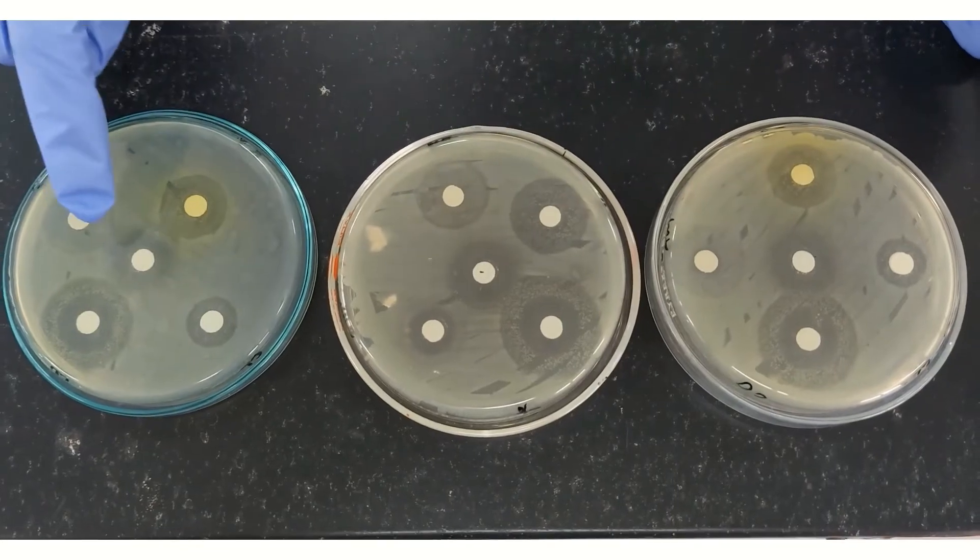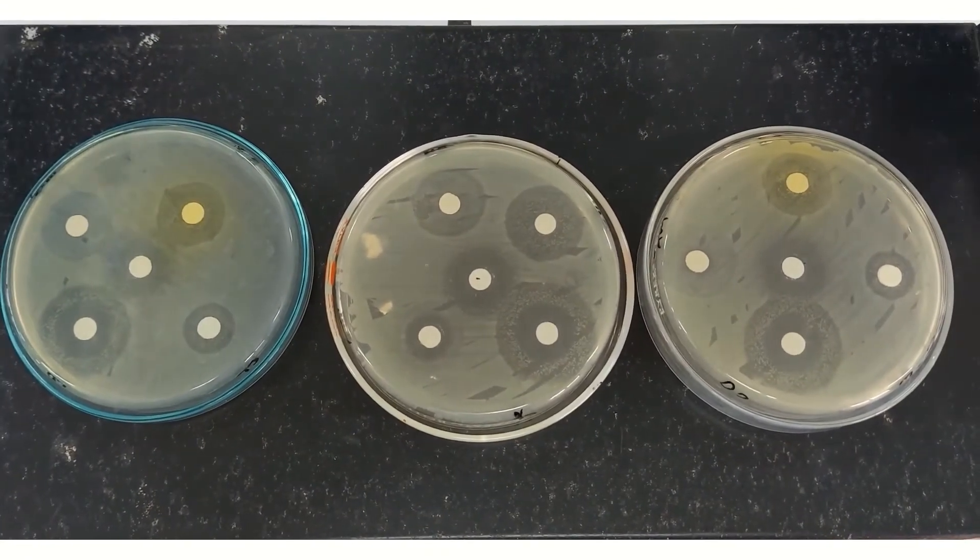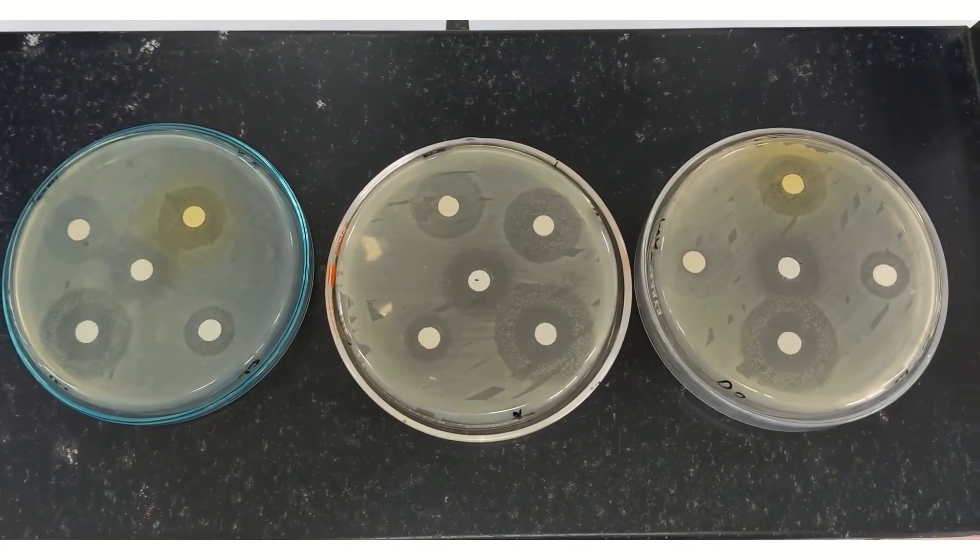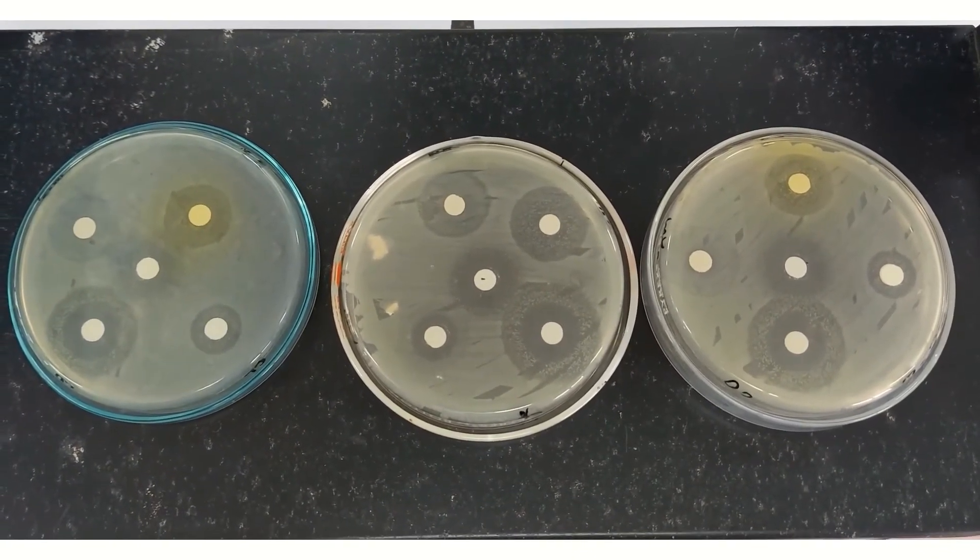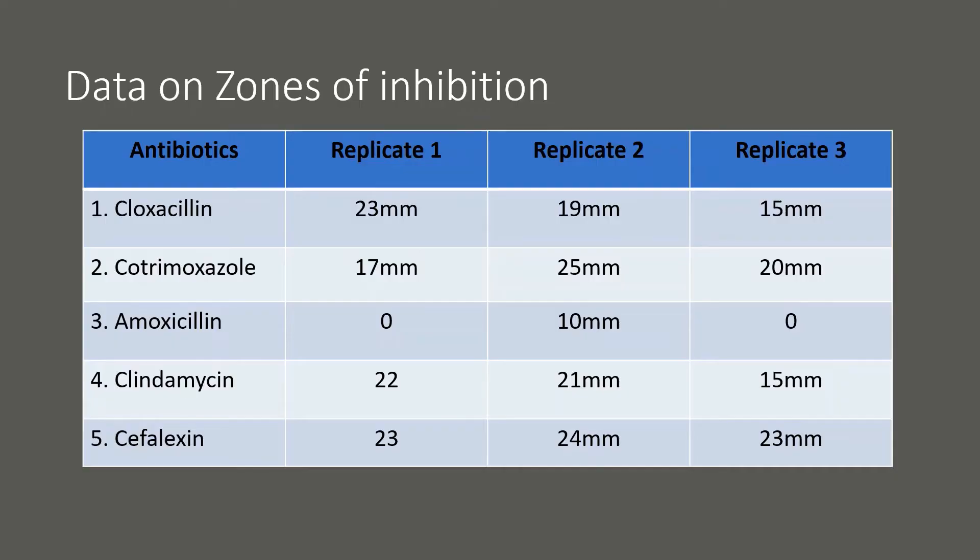Now we are going to measure all the zones of inhibition in our petri dish 1, 2, and 3. This one here is our replicate 1, this one is our replicate 2, and replicate 3, so we will have data that we can conduct statistical analysis. Let's see which antibiotic would give the highest zone of inhibition and which antibiotics would show the lowest zone of inhibition. Here is the complete data set of the zones of inhibition exerted by the antibiotics that we tested: cloxacillin, cotrimoxazole, amoxicillin, clindamycin, and cefalexin. We have data for replicate 1, replicate 2, and replicate 3, enough to conduct statistical analysis so we can know to which antibiotics our bacteria is susceptible to and to which antibiotics it is resistant to.